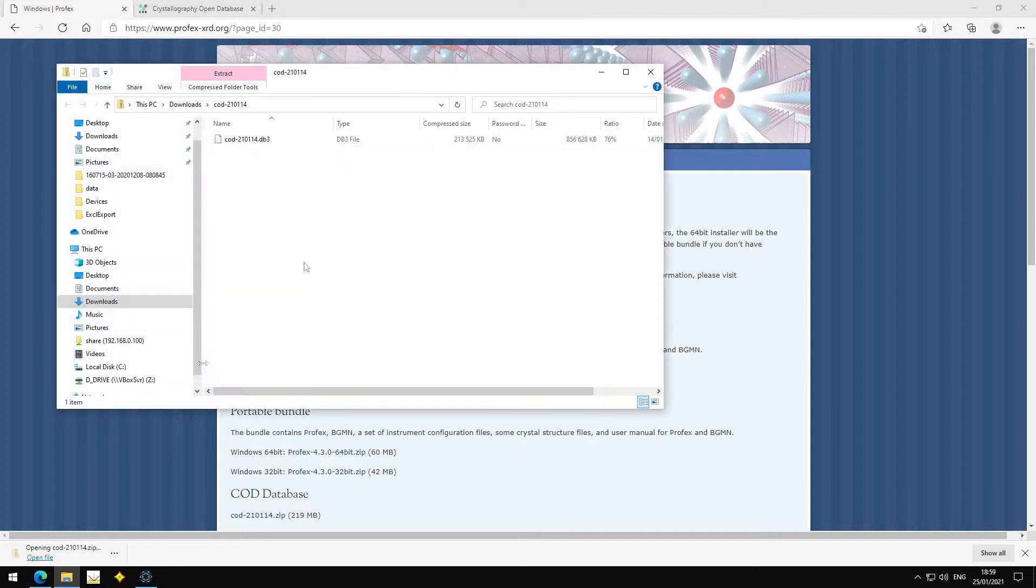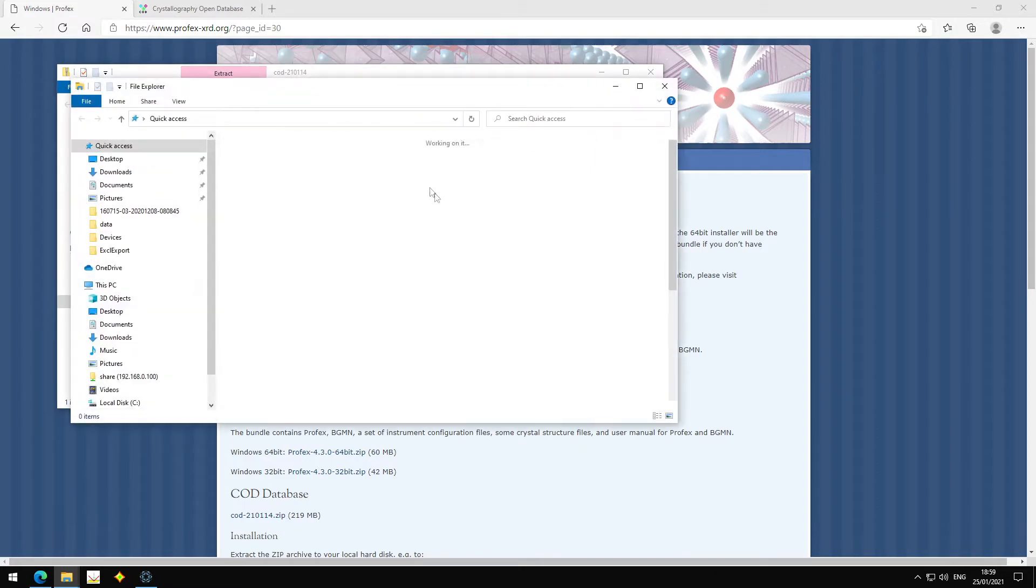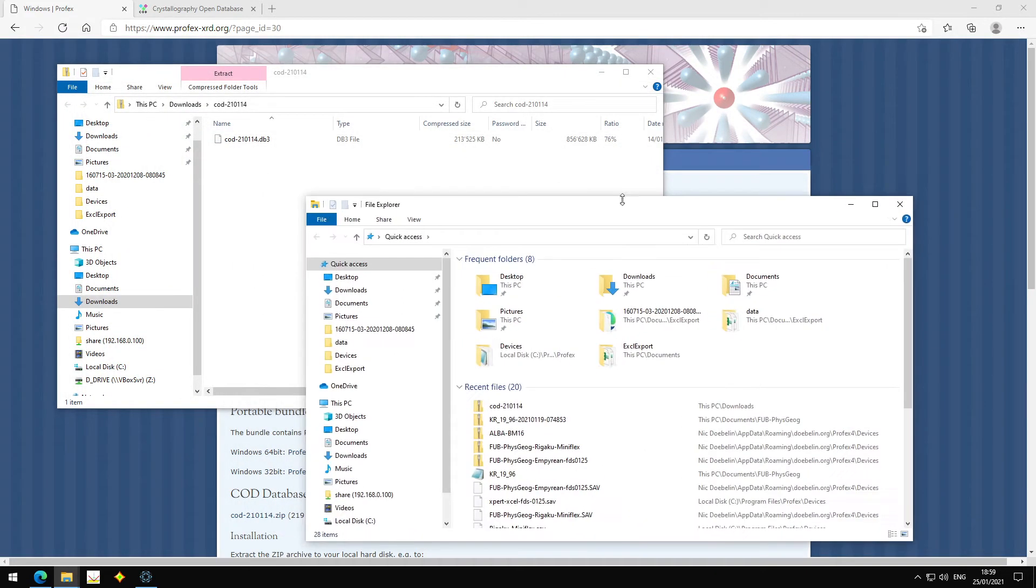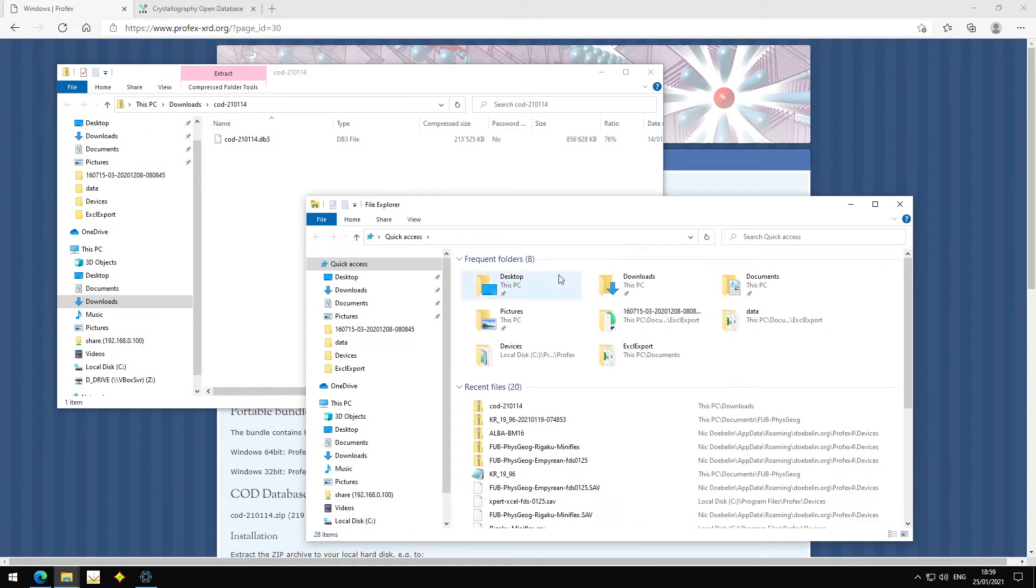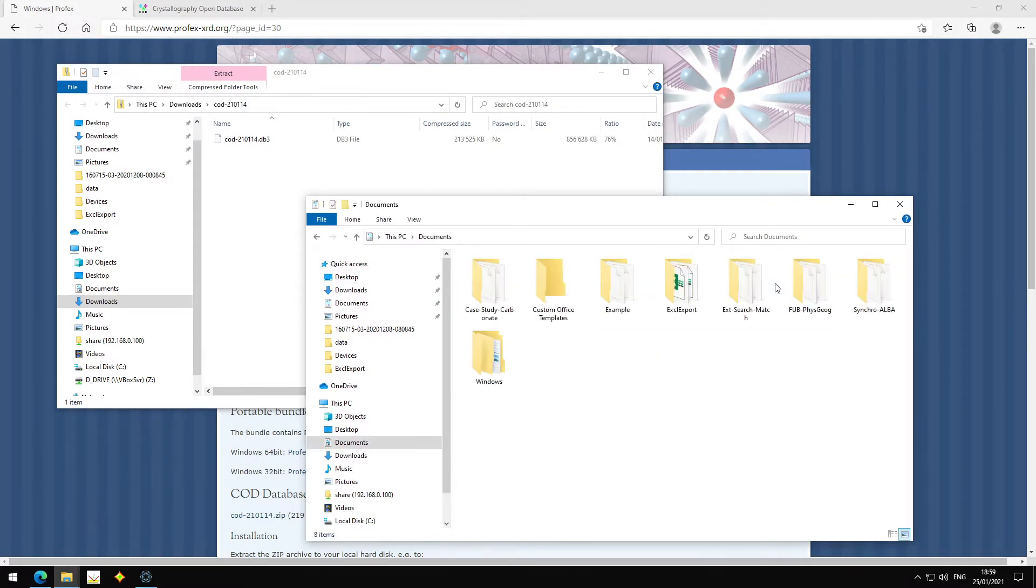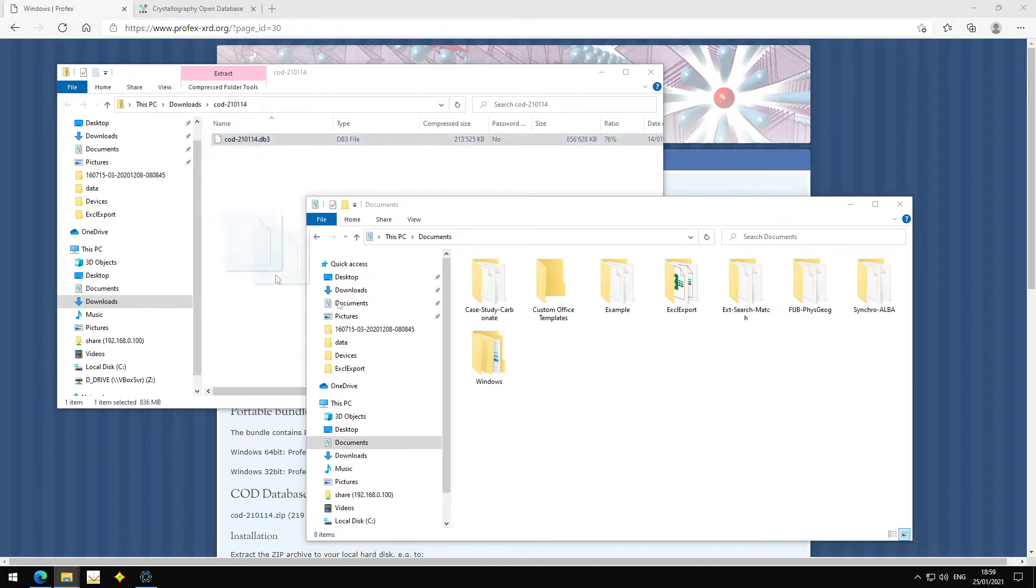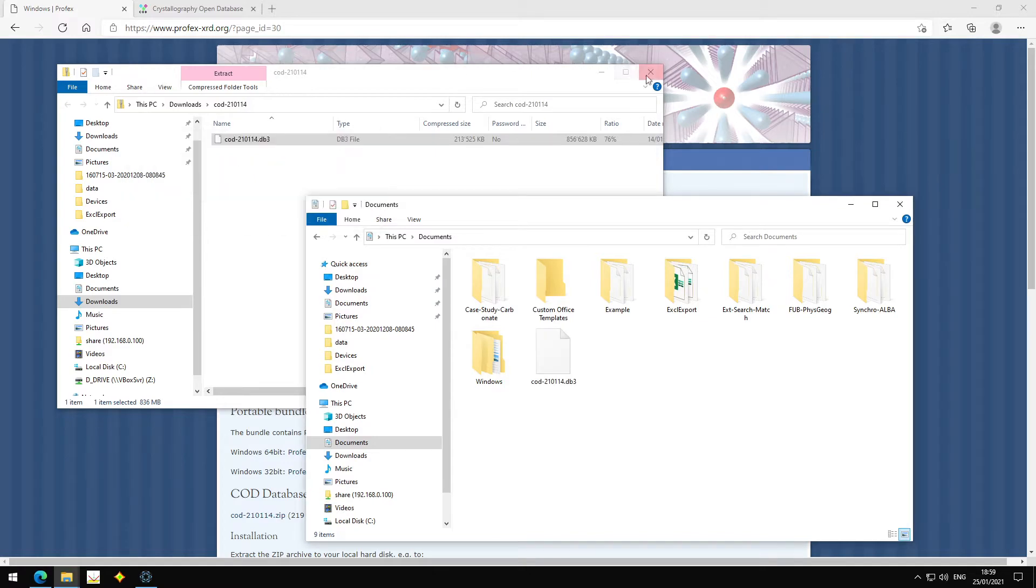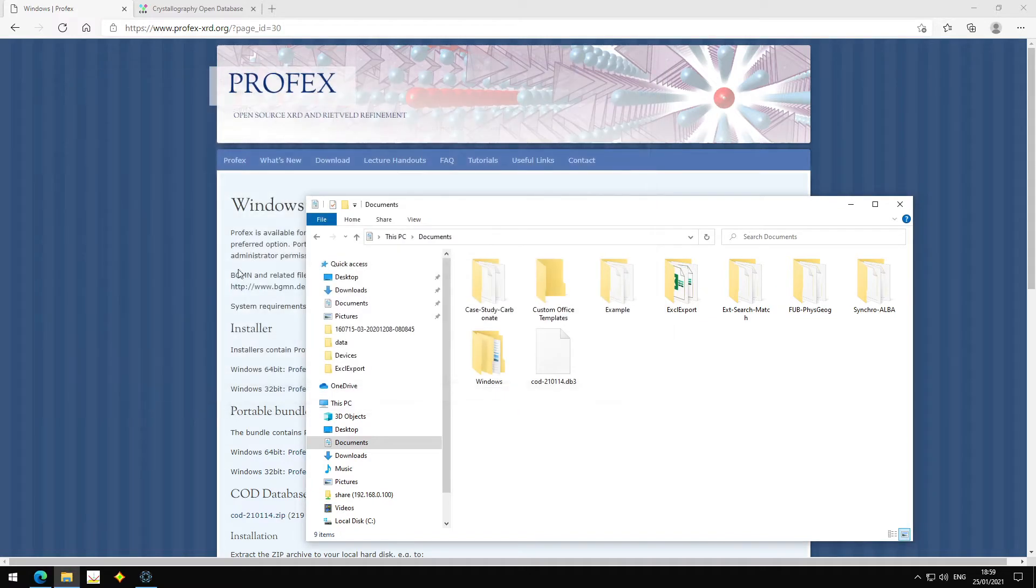Then we open the file and we find one database file inside. And this DB3 file we need to copy somewhere to our documents folder, for example. That's all.